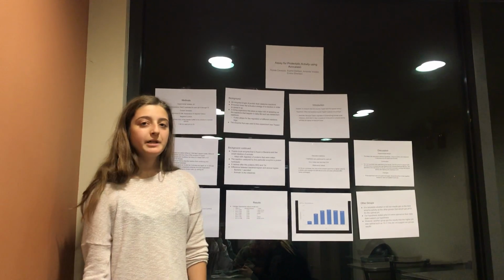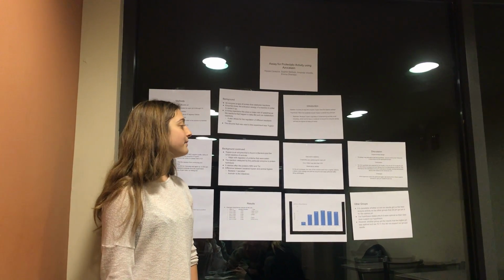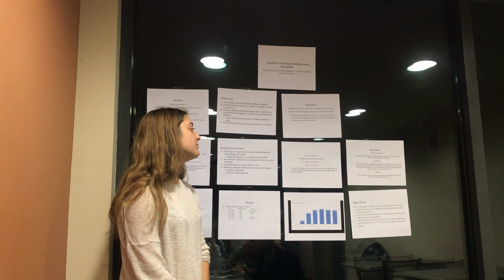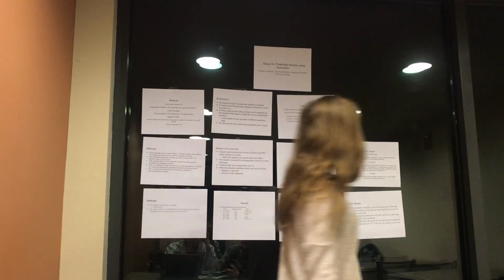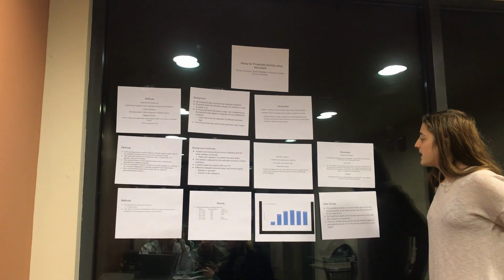3 replicates were performed for each pH in our experiment, and our p-value was less than 0.05 for the t-tests. Our observations in this experiment were that as the pH increased, the color of the solution went from a lighter color to a darker color, orange red with the enzyme, and then a clear yellowish after we centrifuged it. This experiment, we concluded, was adequate to test the hypothesis.